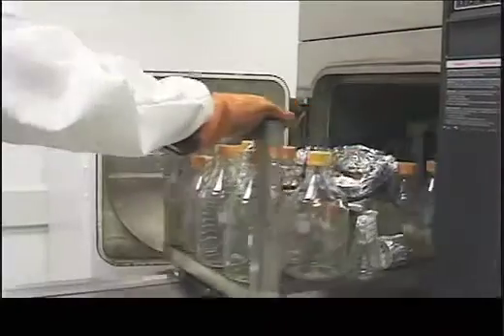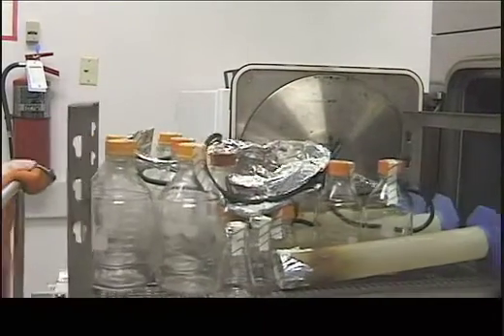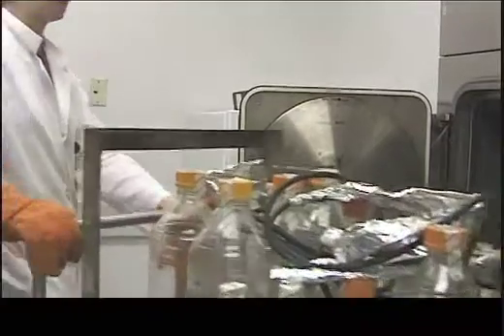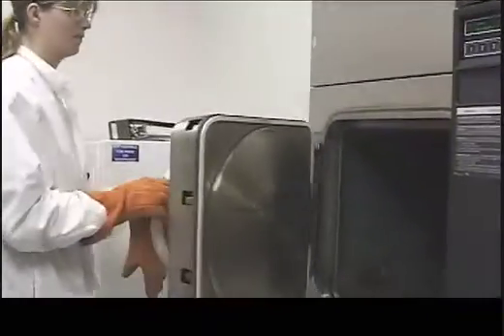Why is it necessary to sterilize the glassware? We have to sterilize the glassware because we reuse it. By sterilizing the glassware, it ensures that we get rid of all contaminants. If we had contamination, it might make us think that DNA from one organism belonged to another organism, and that would be a huge mistake.